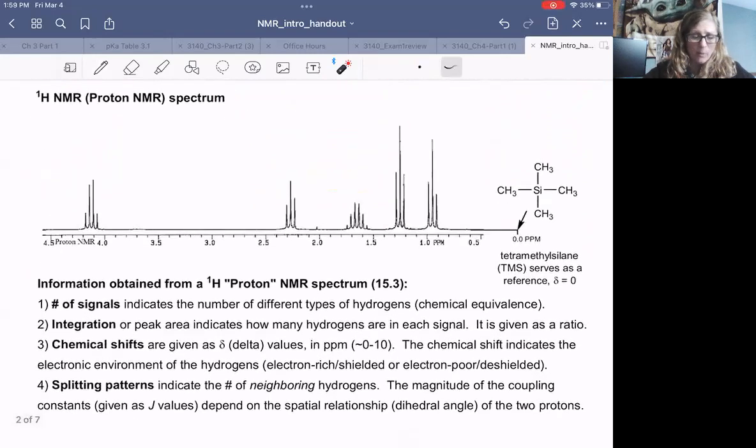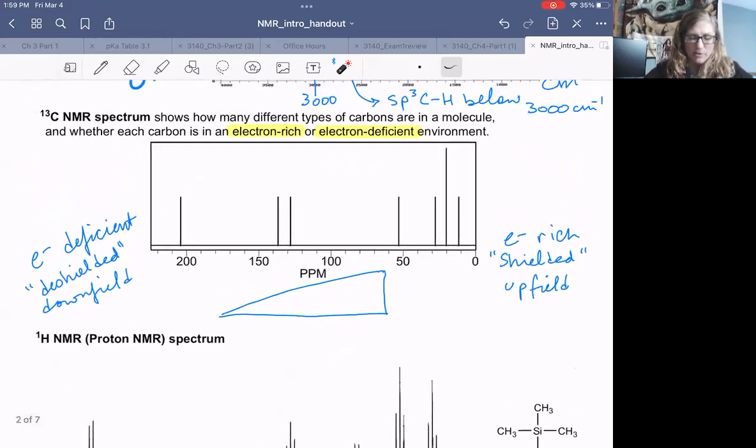Okay, so I will talk a little bit about C13 NMR. We'll spend some time analyzing those, but primarily the biggest thing, and actually I can mention it super quick, is that there are really three different regions that we want to look for when we see carbons that occur somewhere in the 200 region, around there.